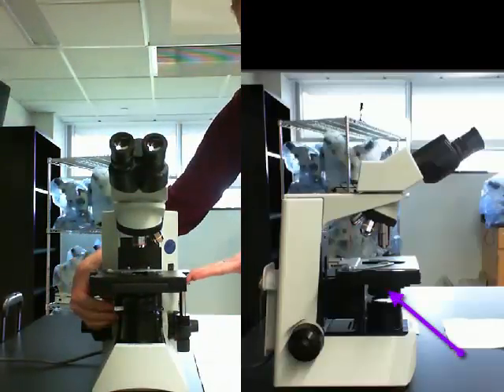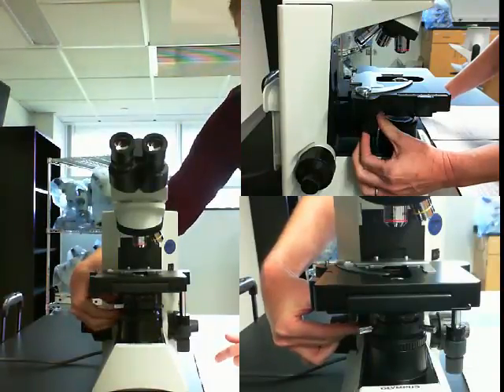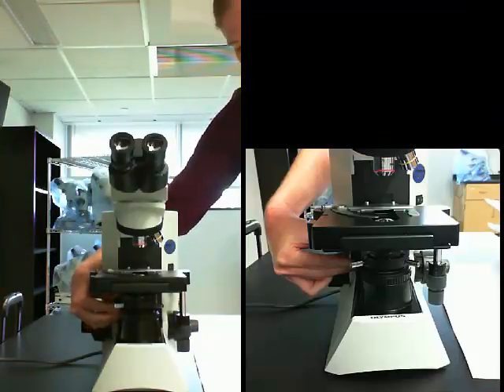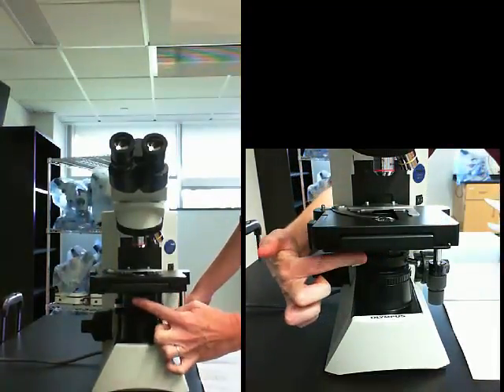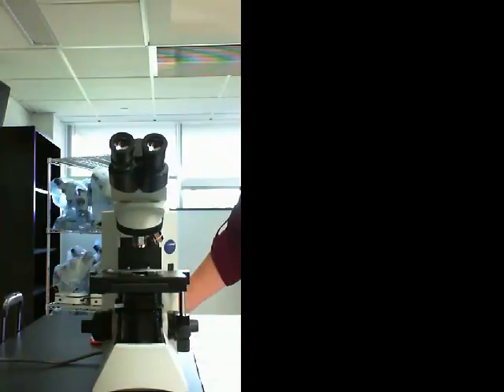Okay, so beneath the stage, we have the substage condenser, which is this element of the microscope right here. It has its own knob that allows you to move the substage condenser up and down. And the substage condenser, as the name suggests, is concentrating light or condensing light onto the specimen. Part of this is also the iris diaphragm, which is controlled by this lever right here. And this is functioning like the iris of your eye. And we're going to have you manipulate both of these elements of the scope when you're looking at your specimens in lab to fine-tune the image and make the best observations you can of your specimen.